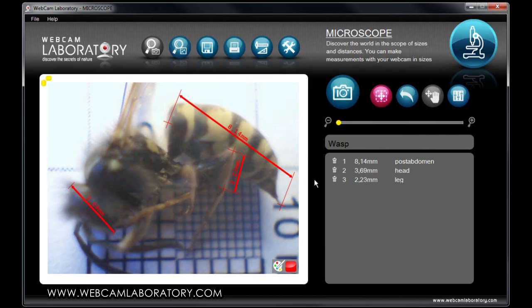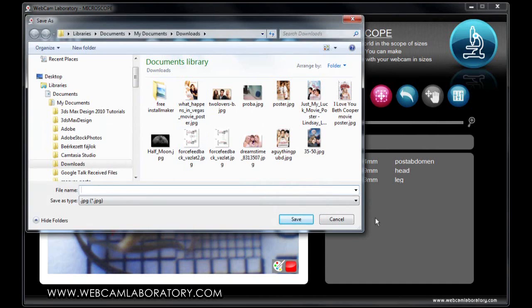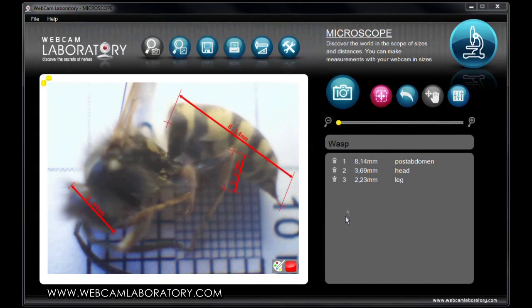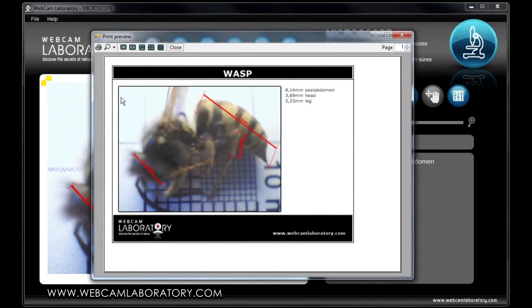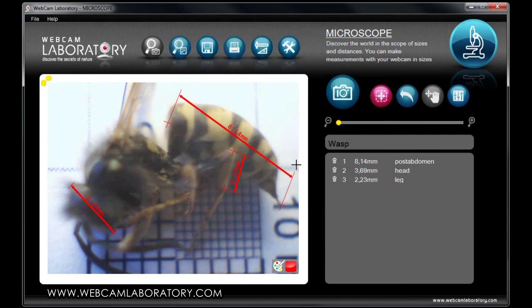Once you are finished, you can save the measured picture by pressing the save button, or print the picture if you wish. After pressing the save button, you have to input the desired name for the picture and saving is complete. If you press the print button, the print window will emerge where you can press the printer icon in the top left corner to activate the printing process.